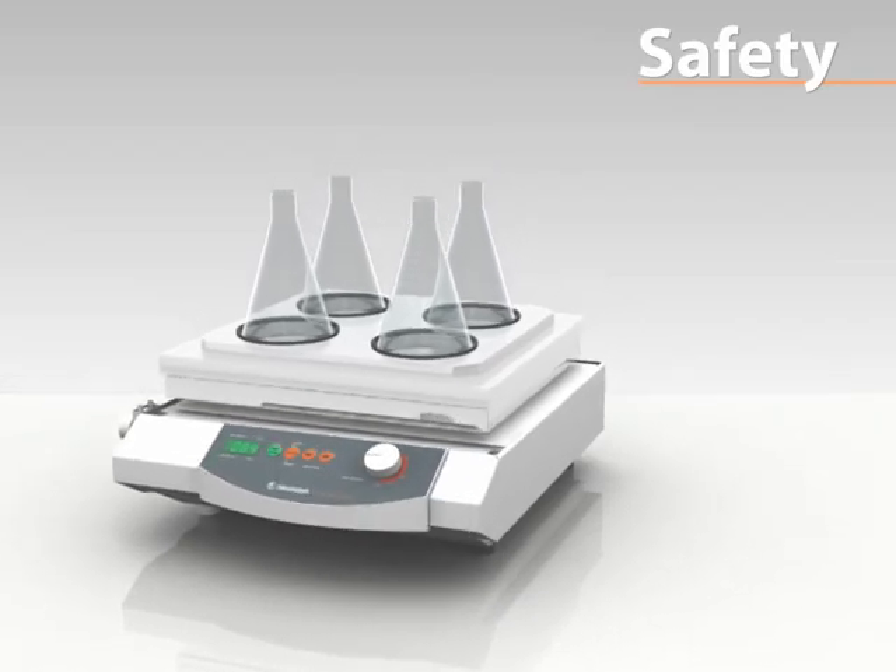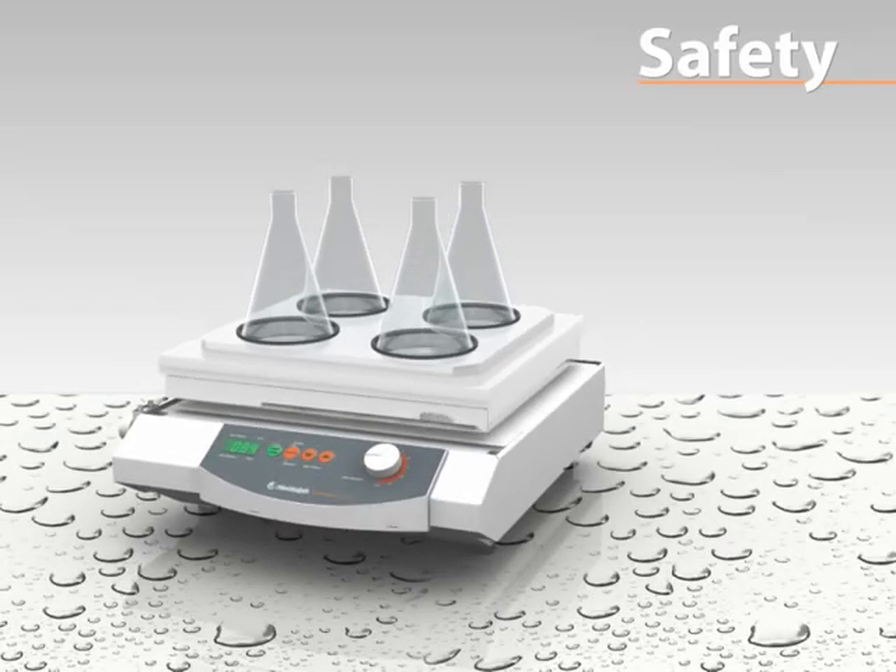All models have been designed with a low centre of gravity, which prevents gliding at high speeds, even on a damp surface. This feature rules out any potential accidents.